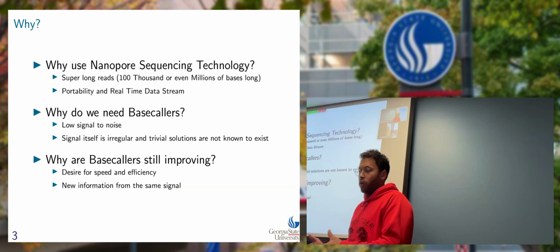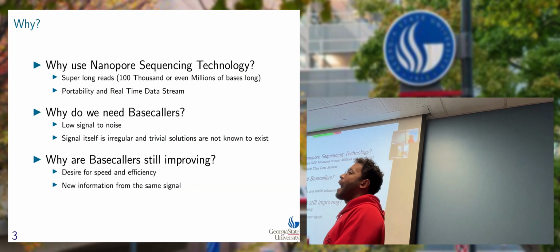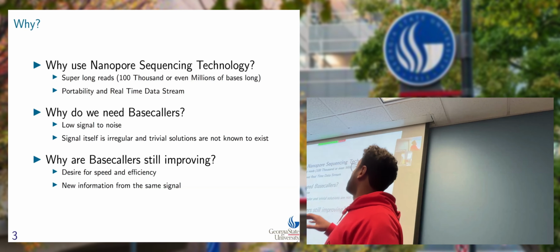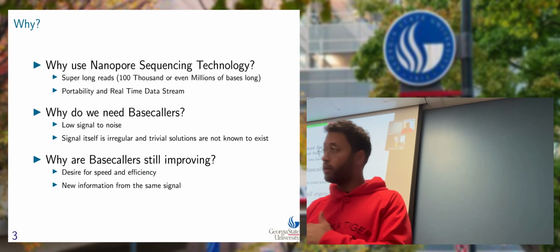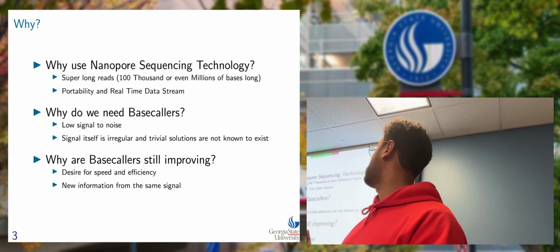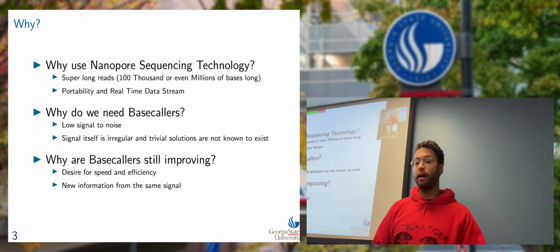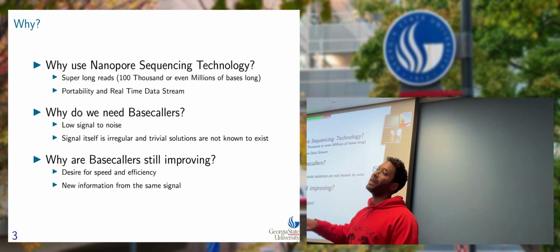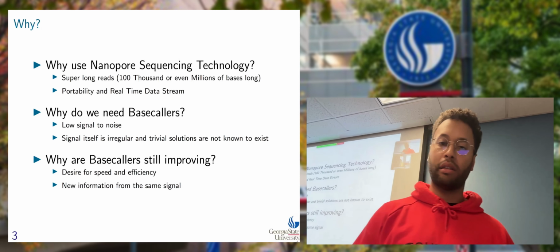If you're in the field working with sequencing, you don't want something that's going to take hours, days, weeks, or months. You want speed and efficiency. You want to be able to do it on this Minion device that you can fit in your backpack, right next to your laptop, and you should be able to sequence off of your laptop, right? And not only that, but this squiggle may contain additional information besides just that of the bases.